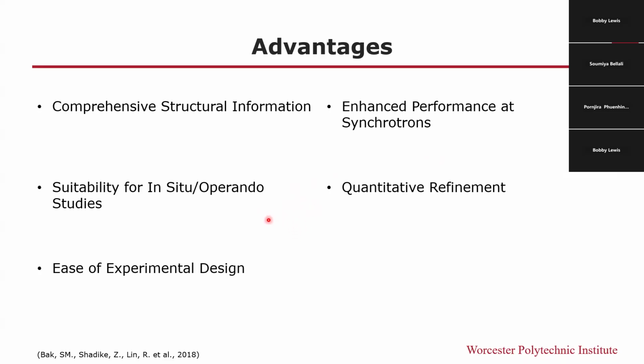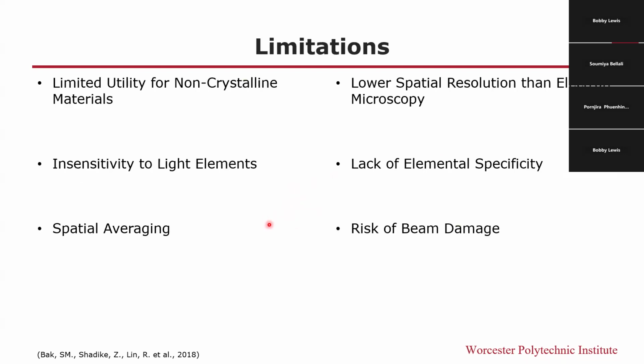Onto the limitations of X-ray diffraction. There is limited utility for amorphous materials. It really is only effective for long-range order crystalline materials.